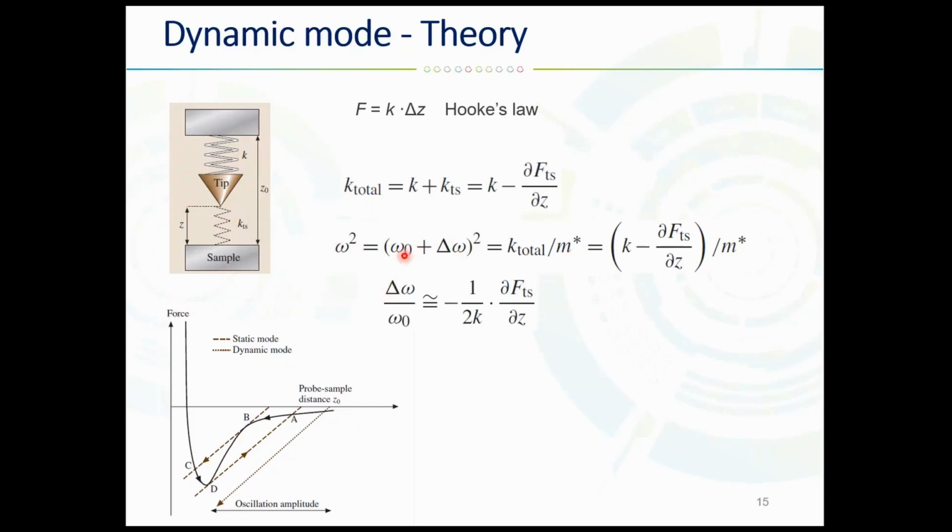And this is the actual equation for this, and it depends on this total spring constant, and m here represents the effective mass of the cantilever.